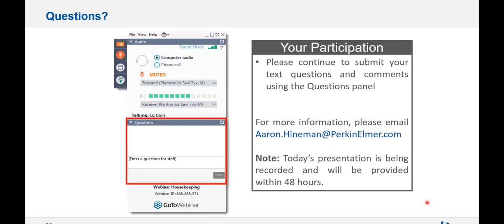And residue as well. Say your blood analysis, from what I've heard, you're going to get so much residue in there that at that point you have to change your graphite tube as well. And I guess the contacts as well. And firing temperature too, atomization temperature too, right? And the length too. If you have a refractory element, where you have a long atomization time of 8 seconds or so, then you'll need a longer clean out time, that will affect it as well.